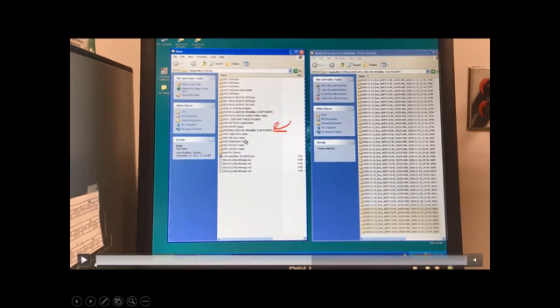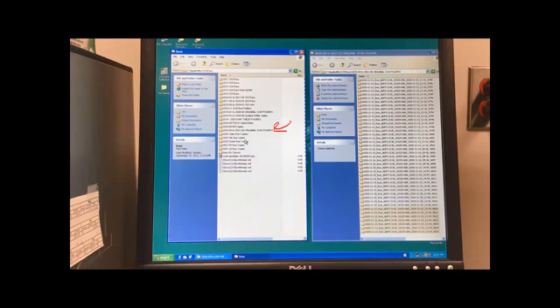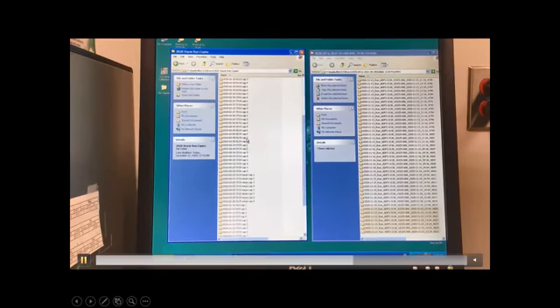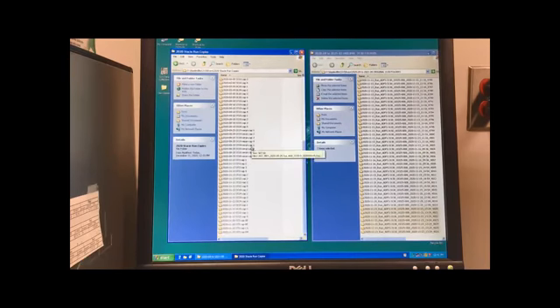Okay, so what I'm going to do is those files from 1123, those were Stacy's. So watch what I'm going to do when I open up Stacy's folder. Okay, so Stacy has all of her stuff arranged, and you'll notice that every date she has, and for 1113, she was running a couple different samples from a couple different runs, so it's a little bit different.